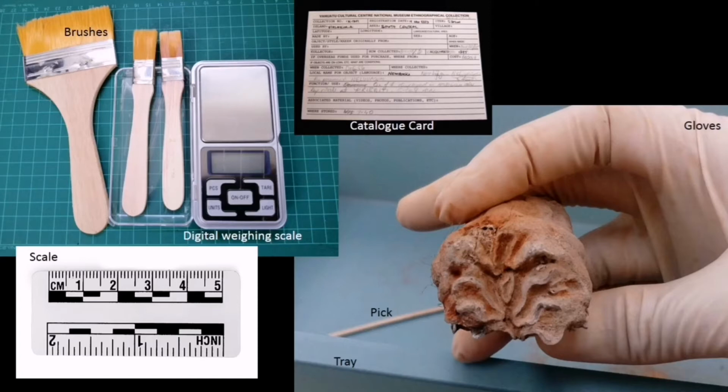includes the information such as the location of where the samples were found, the date of cataloging or the samples were found, the dimension, which is the length, the weight, and the anatomical features, if you could identify them, taphonomy, if you had identified to which species the sample belongs.